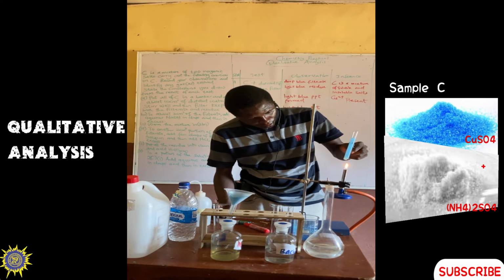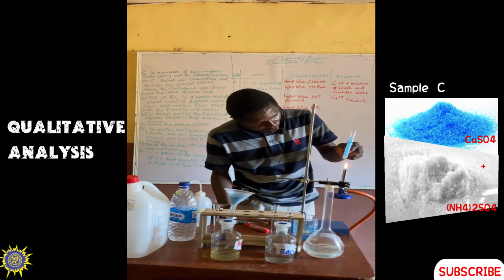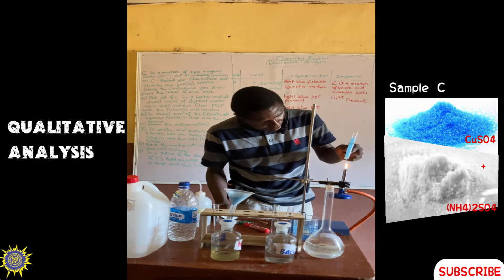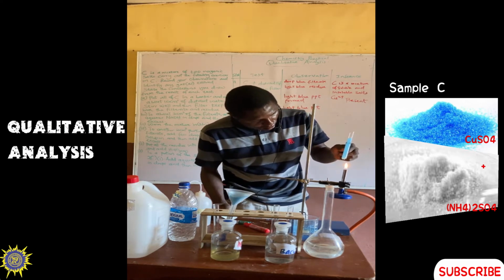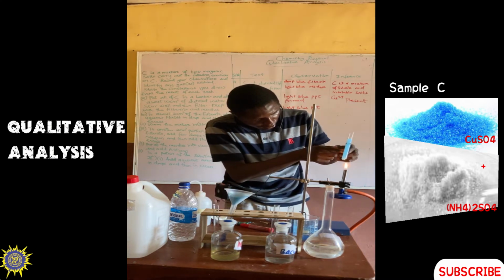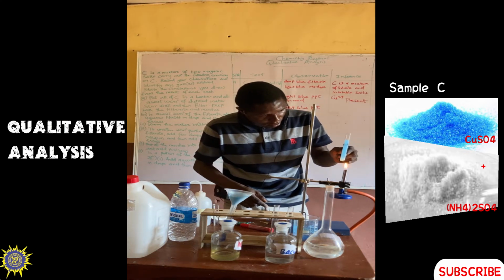Now you will see that the blue precipitate will change. It's changing already. With time it will change to black, from blue to black, on warming.